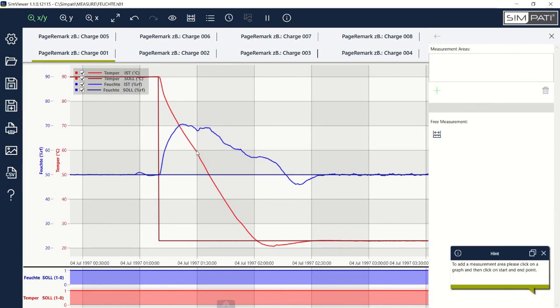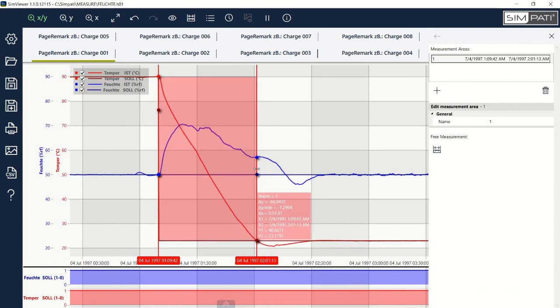The next item is clicking the data curve that you want to analyze. So here I'm going to click this pull down, and you can see that it got bold. And then I'm going to zoom back to about right here. That's where it starts. And then once you click, a new data point pulls up, and I want to go to 23.